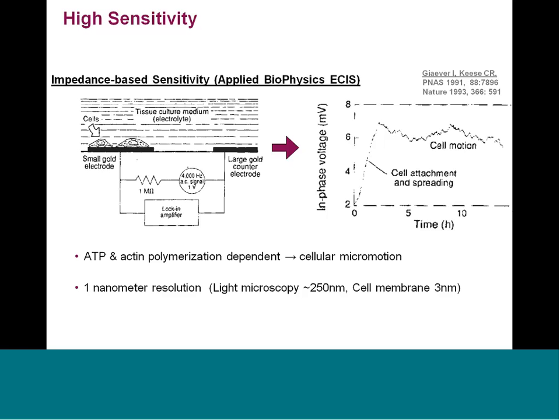So this is, as I showed in the previous slide, it's not a rounding up. That cartoon was misleading in a lot of ways. It's rather just an exquisitely subtle ruffle of the membrane is enough to be detected. So that really should change the way some people think about this, from morphology changes that are real rounding up to just really slight ruffling of membranes would be enough to be detected in some cases. So 2 orders of magnitude increase in sensitivity.